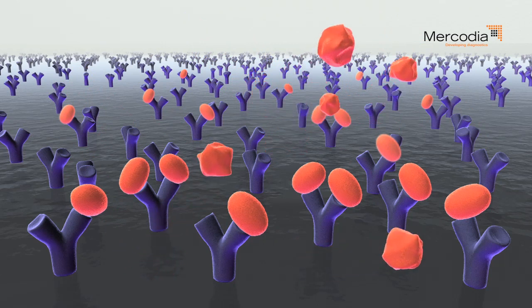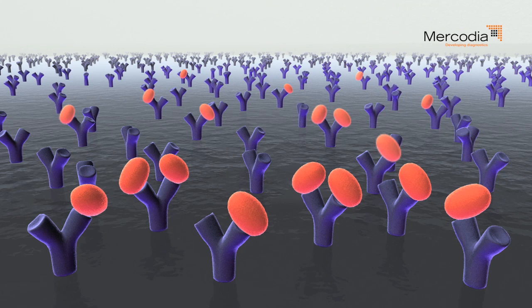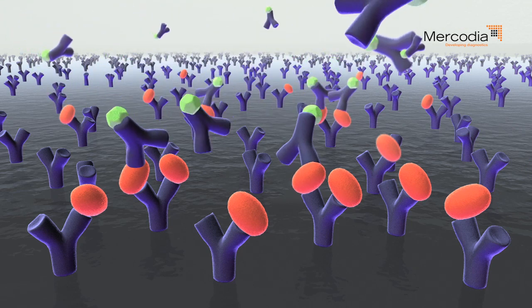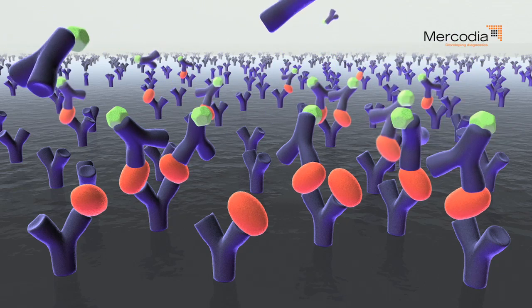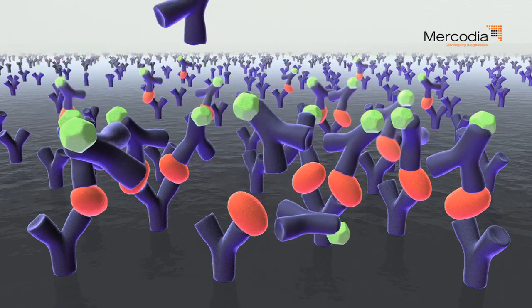Unbound compounds are removed by a washing procedure. The enzyme-linked detection antibody is added to the well. The detection antibody binds to a second epitope on the antigen.